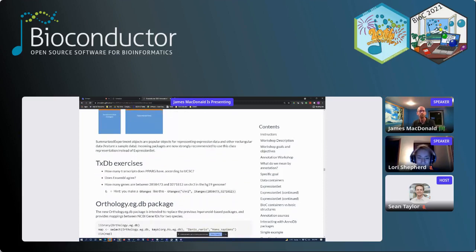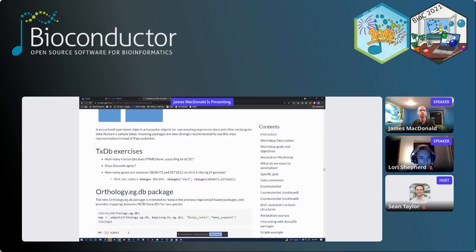So I know that was pretty fast, but hopefully it wasn't too fast. So here are some TxDb exercises we can try. How many transcripts does PPARG have according to UCSC?